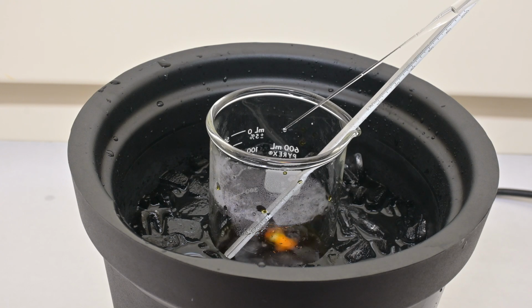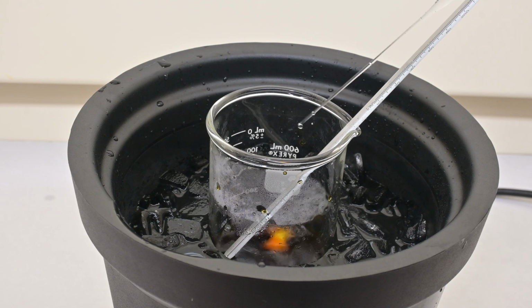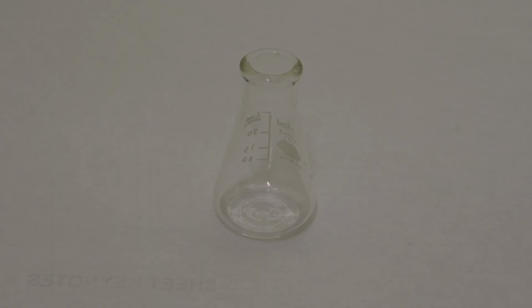It is crucial to proceed immediately to the next step, as the resulting diazonium solution is unstable and should not be left standing longer than necessary. The next step is a coupling step where we take the diazonium sodium salt that we just produced and couple it with an aromatic ring.